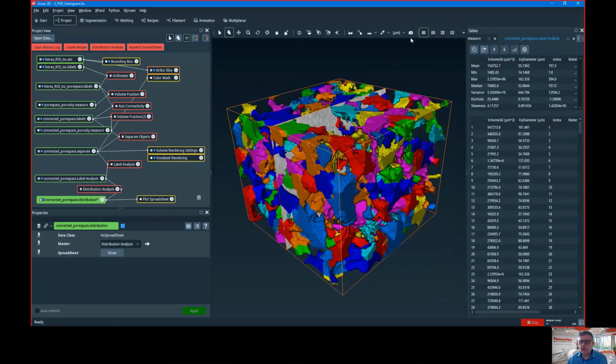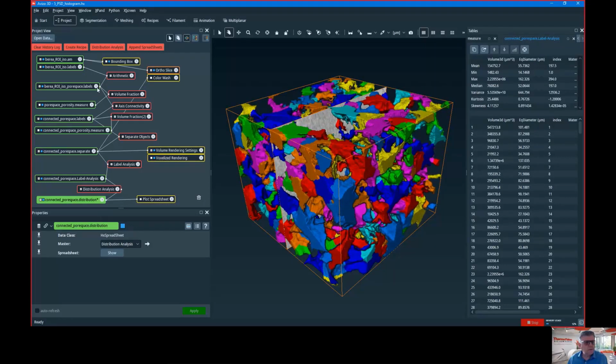What else is important? You can take a snapshot. You can change the scale because the software works with scale. You see here. Yeah, I think you had a small cut on the line, I guess.